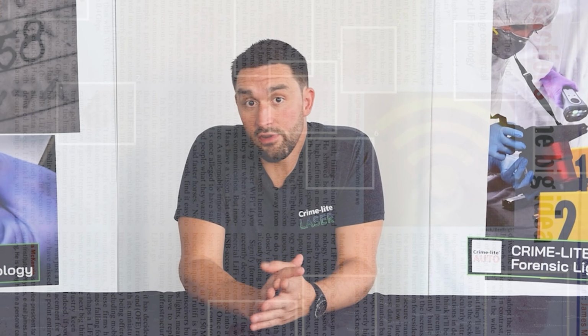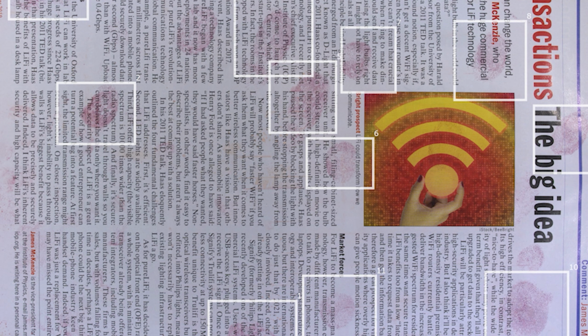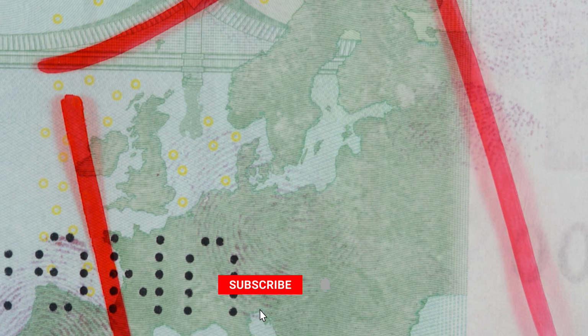When using ninhydrin, for example, the chemical reaction produces a new compound that allows the finger marks to be observed as a purple impression. We call this Ruhemann's purple, named after the chemist who discovered ninhydrin in the early 20th century. On the other hand, when DFO binds with amino acids, it forms a new fluorescent compound, which can be excited using a forensic light source.